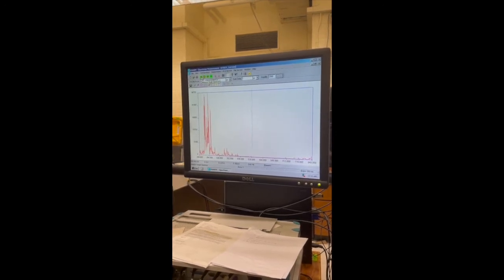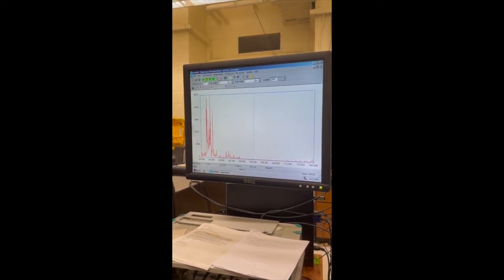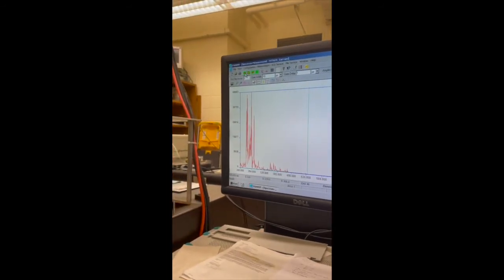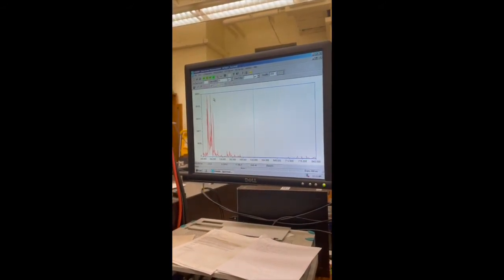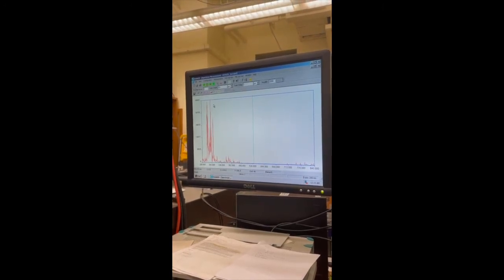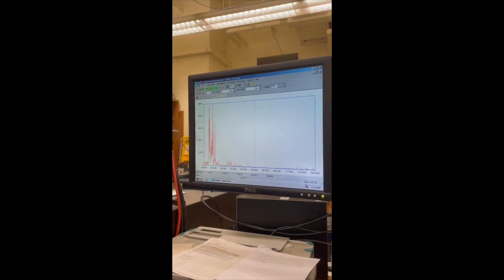Everyone has their glasses on still? I heard, sounded like 4. And there you go. So it's approximately twice as big now. So that's what the on-chip accumulations, or OCA, is. So let's go ahead and set that back to 1.